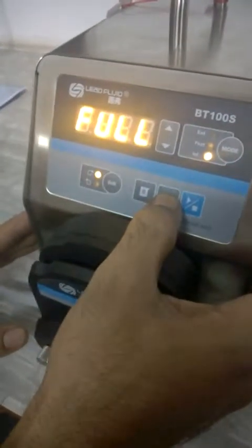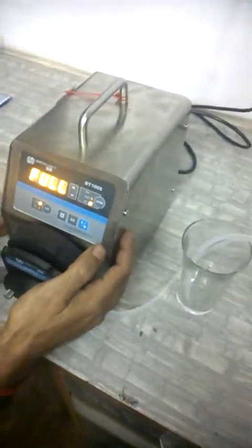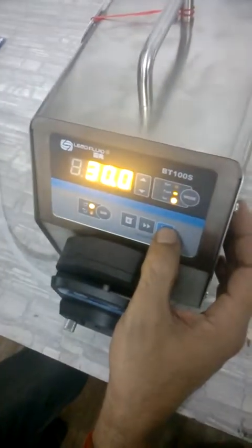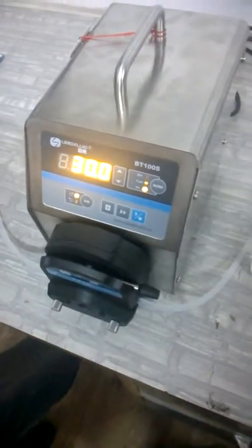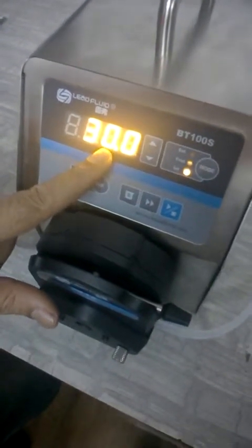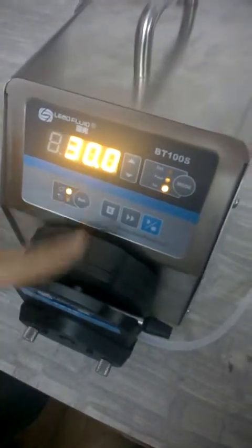We are flushing the pump first so that air is taken out. Now the RPM is set to 30 and I am starting the pump — this is giving a flow of 24 ml per minute. If we increase the RPM, the flow will also increase. Flow depends on two parameters: the RPM and the inner diameter of the tubing.